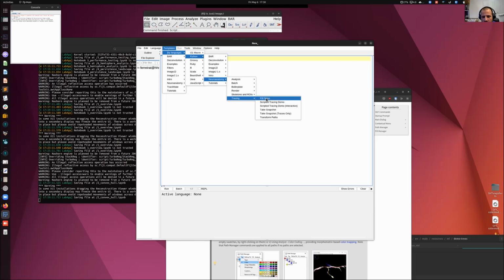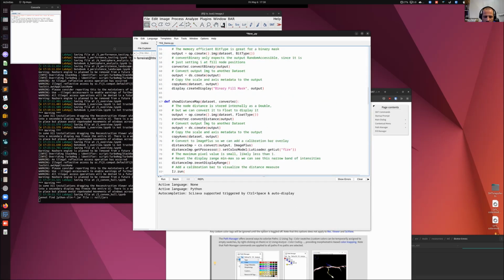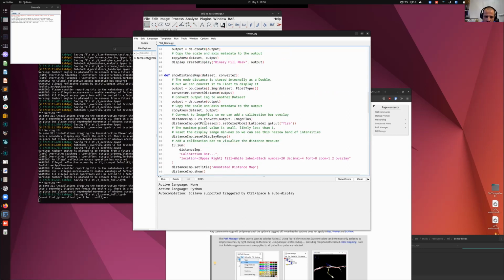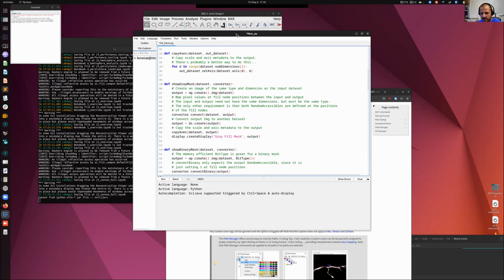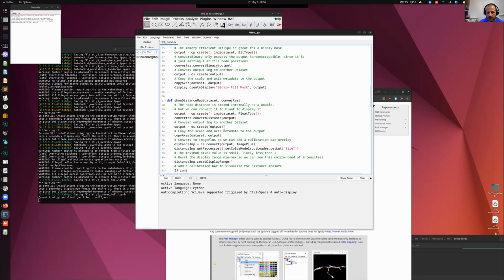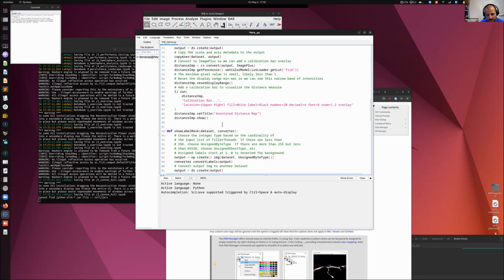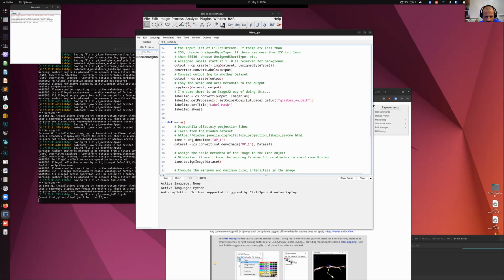I guess we could use this example, alpha filling. We try to have all the examples be self-contained, so if you don't specify an image, it should run on the demo image. But it's not always possible to have data available all the time, and some scripts may require a proper local image to be available.